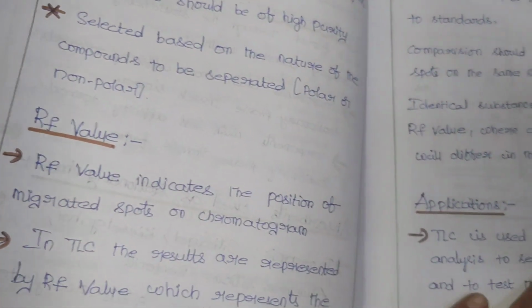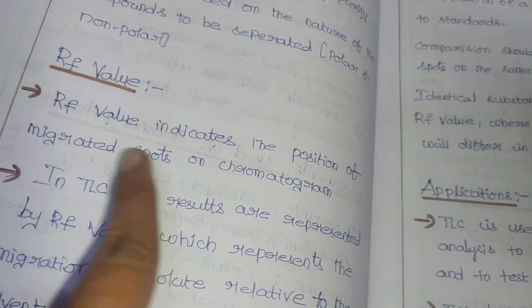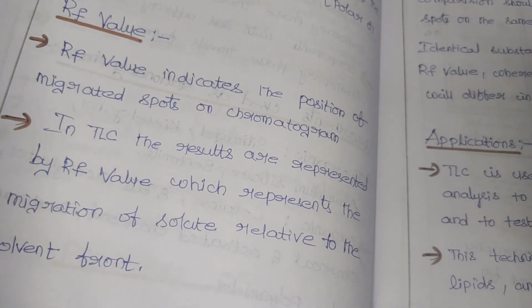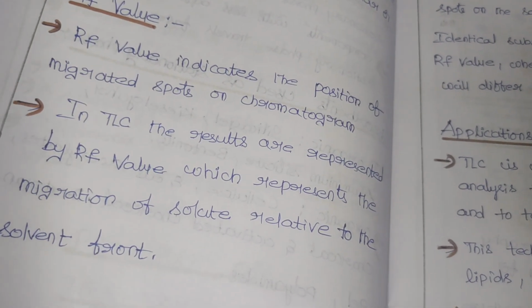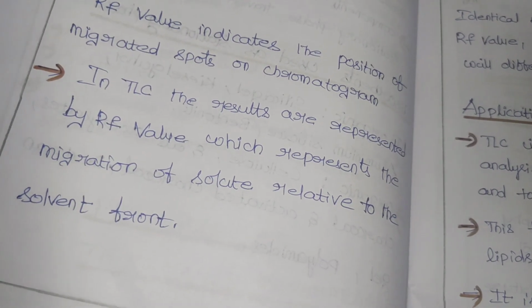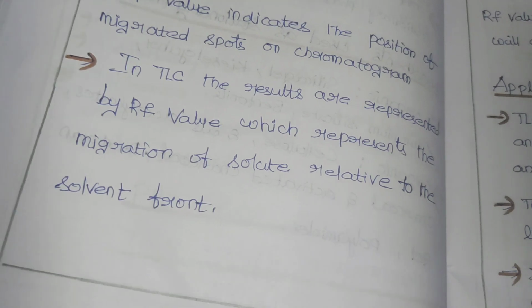The Rf value indicates the position of migrated spots on the chromatogram. In thin layer chromatography, the results are represented as Rf values, which represent the migration of the solute relative to the solvent.